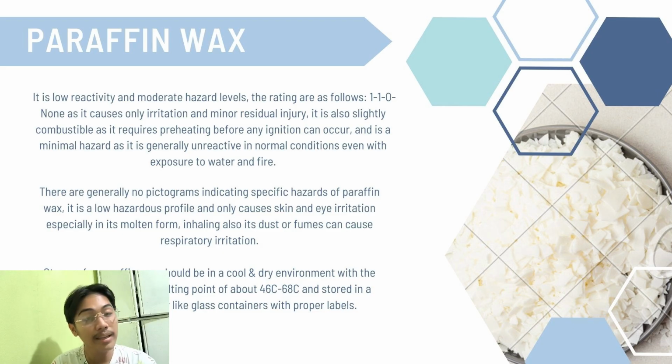For the NFPA rating, paraffin is generally safe because of its low reactivity and its moderate hazard levels. The rating is as follows: 1, 1, 0, none, as it causes only irritation and minor residual injury as other chemicals mentioned here used in the histopathology laboratory.